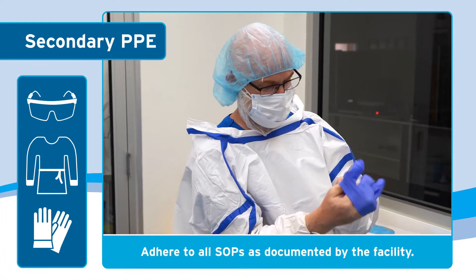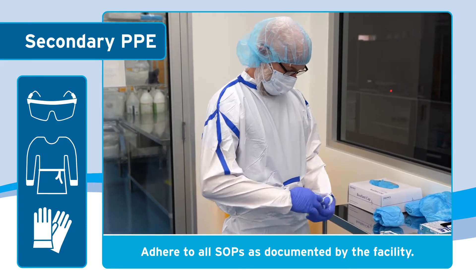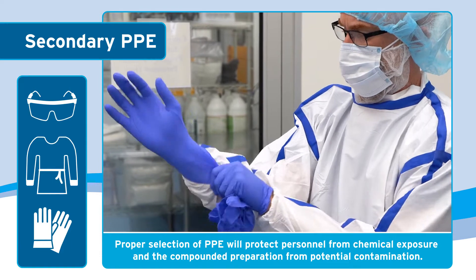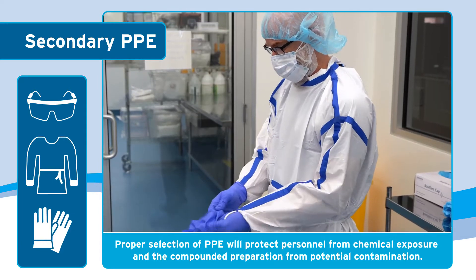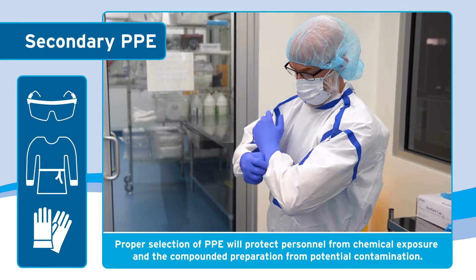The personal protective equipment must be appropriate for the type of compounding and documented in the facility's standard operating procedures. The proper selection of PPE is to protect personnel from chemical exposure as well as to protect the compounded preparation from potential contamination.